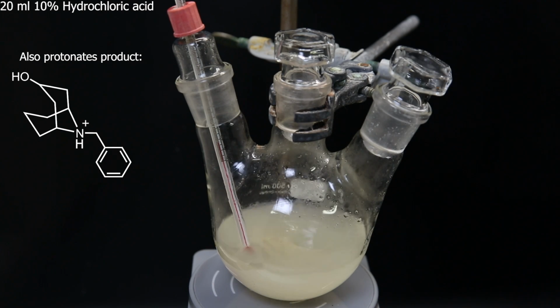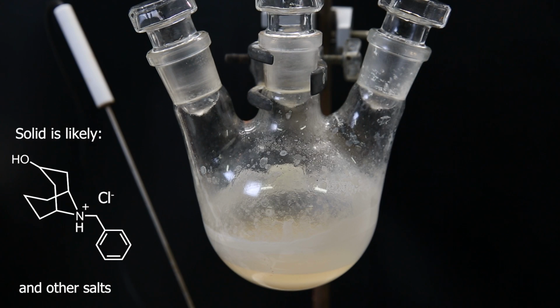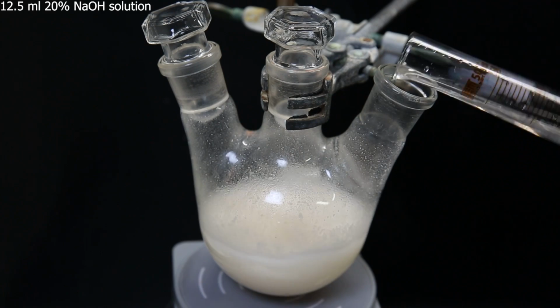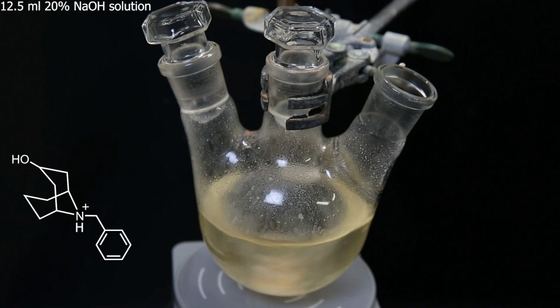I then set the mixture up for short path vacuum distillation to concentrate it to somewhere between 25 and 50 ml. Afterward, I am left with a light yellow solution and some solid that has precipitated out. Now to this mixture, I add 80 ml of MTBE and stir it. I then add 12.5 ml of a 20% sodium hydroxide solution to adjust the pH to 11 to 12. This will cause the product to deprotonate again and move into the organic phase.